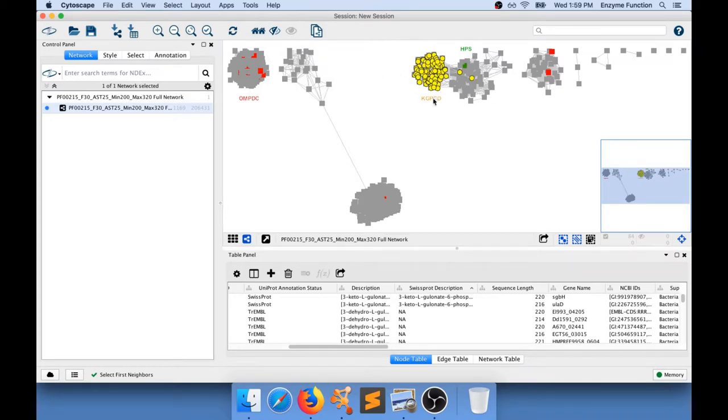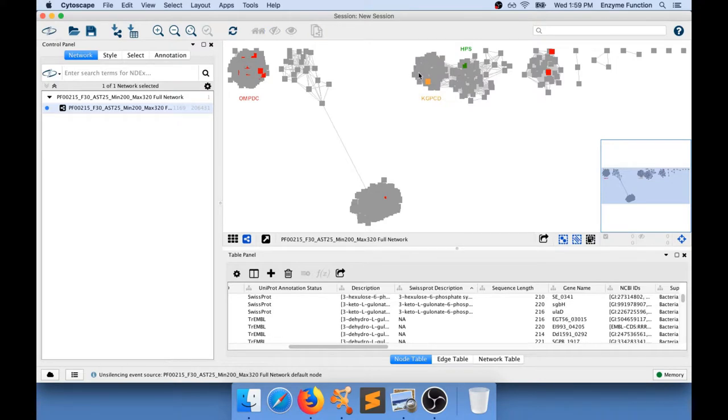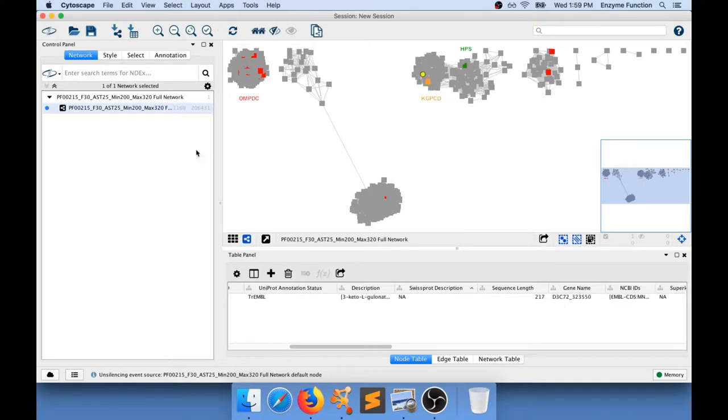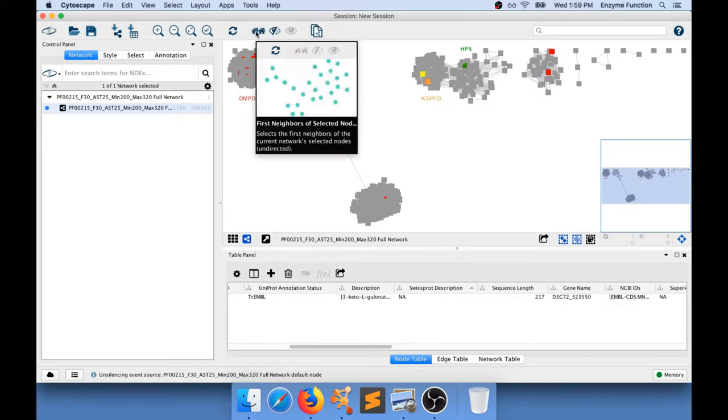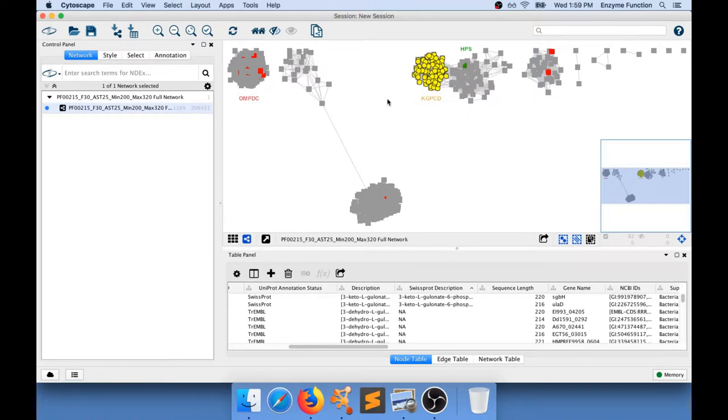So what you want to aim for is actually select only the nodes that are present in these little sub-clusters. So what I can do is pick another one and this time I'm going to use this button in here and I'm going to select only that little sub-cluster in here.